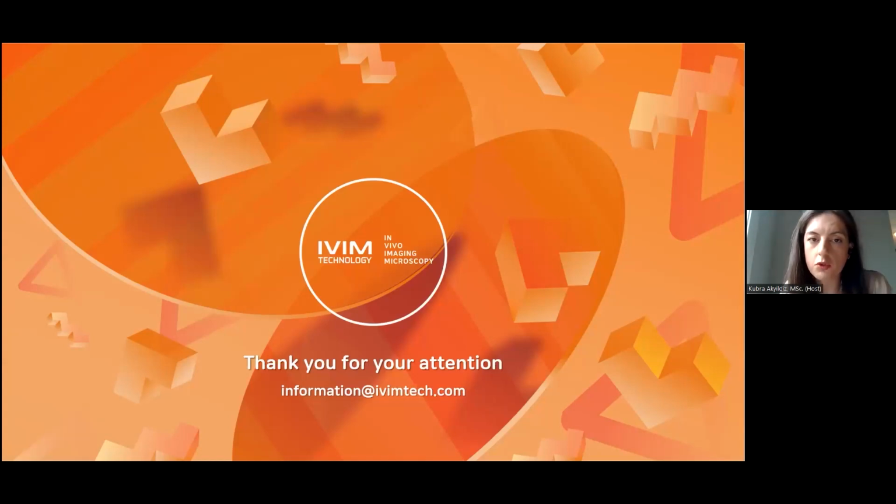The first question is from Rick, and he is asking what depth of tissue can be imaged. Also, is developing a kit for imaging a new organ, for example the spleen, readily doable?